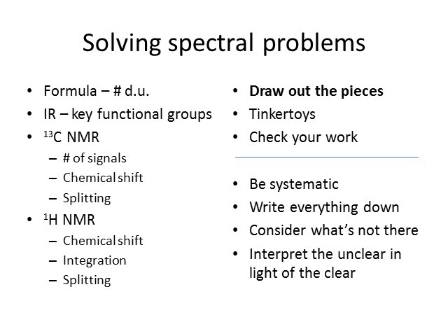And sometimes I might realize that because of symmetry, I might need more than one of those things, right? Remember we said that when there's symmetry, one signal will represent more than one carbon. So maybe I'll realize that I need one more carbon and 3 more hydrogens, but there's symmetry, and so I'll realize that instead of having one CH3 group, I have 2 CH3s that are related by symmetry, in which case I'd write down 2 CH3 groups.